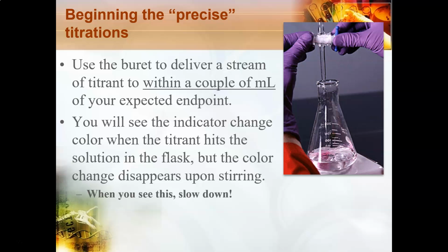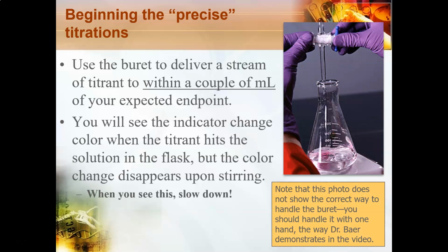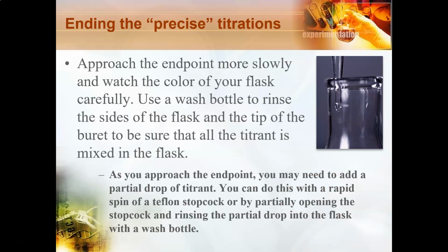I want you to notice that I took some photos from the internet to illustrate this pre-lab lecture, but the person in this video is not handling the buret properly. You should handle it the way Dr. Baer does, with one hand instead of using 2 hands like is shown here. In the precise titration, you want to approach the endpoint more slowly and watch the color of your flask carefully.